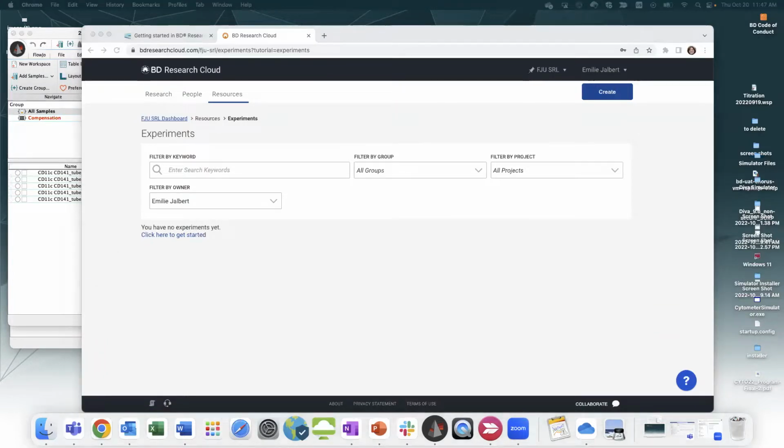Let's see. Can we rename the subject? So let's say if you created the experiment with generic subject names, export the file, bring it into Diva, and within Diva, you want to rename the file, that should work fine as well.